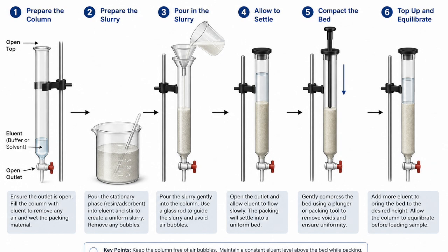The performance is also dictated by the packing, how well it's packed, the mechanical stability of it, does it hold up over time? And then you really need to look at the overall lifetime of that application. Is the column reproducible year after year after year? Or do you have to keep changing your method because the surface of the stationary phase changes over time from the manufacturer?